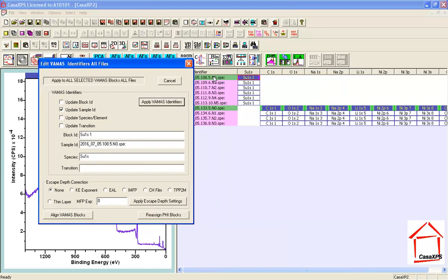But I don't want to adjust the block ID or the element transition fields, otherwise that would alter the arrangement of the VAMAS blocks and the labels that are used to label the VAMAS blocks.